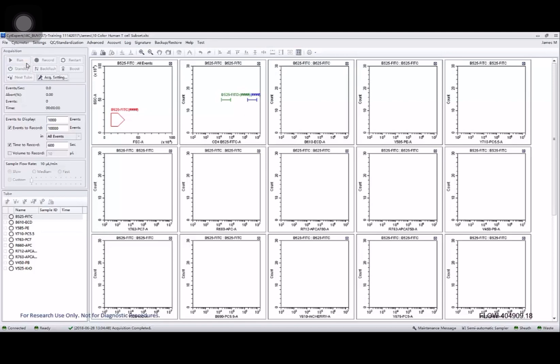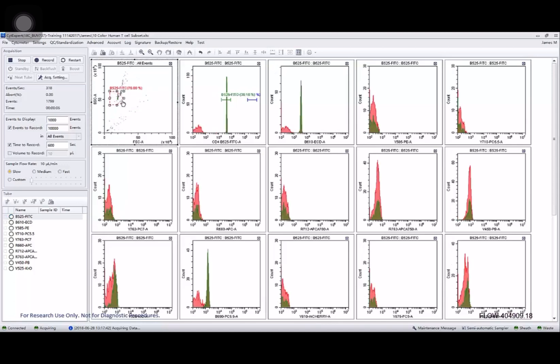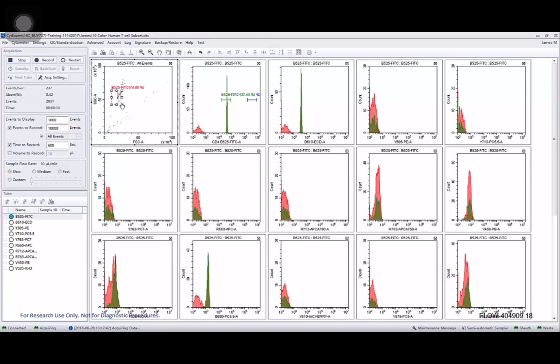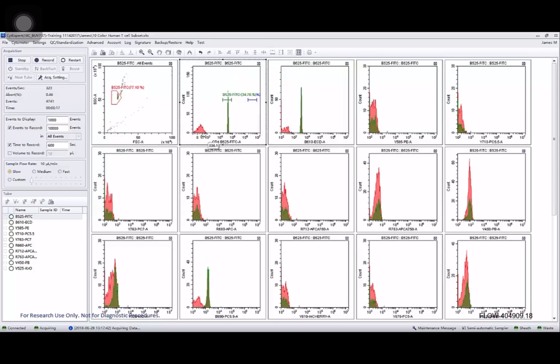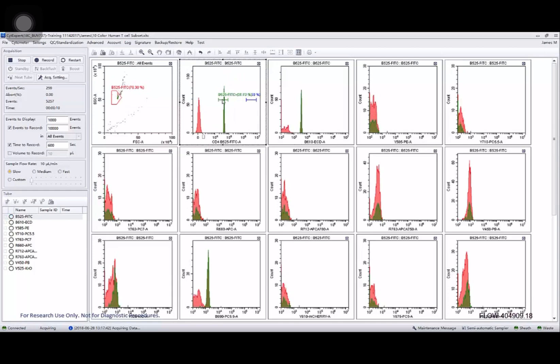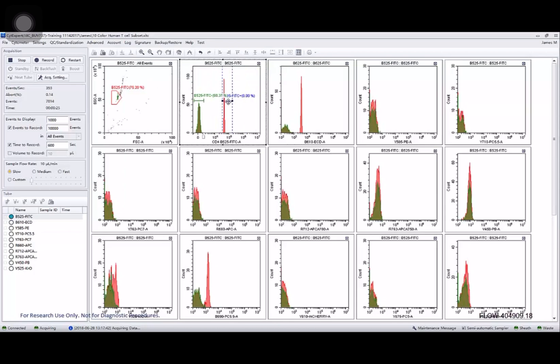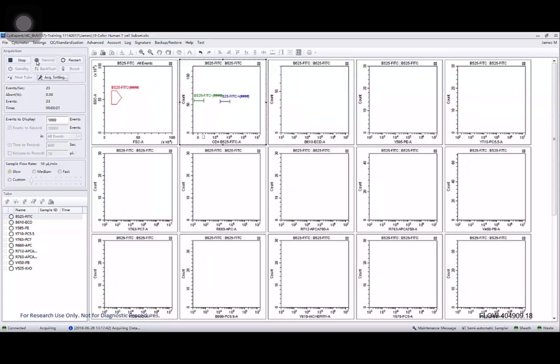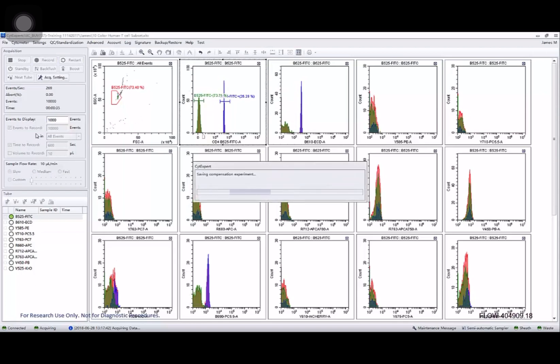Now I load on my bead sample and start running that. And here they are. I'm going to move my scatter gate to contain the singlet population of beads. And then I'm also going to adjust the lin log adjustment on this first plot so that I can clearly see the negative and the positive population and contain those within the gates. And record that file.